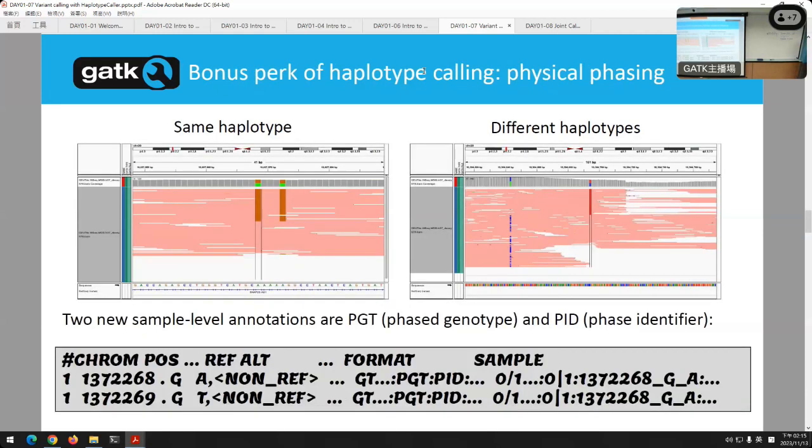And one other important thing with using the graph, this is very important for understanding how mutations can affect their particular samples, is you can phase. Phasing means you could take multiple mutations and tell me if they're on the same haplotype. Haplotype is just a swath of a region of DNA. Right? So looking at the left example, you notice that there's two heterozygous SNPs that are both on the same haplotype. If you have one of them, you have the other one too. So if you got one from your father, you got the other one from your father too.